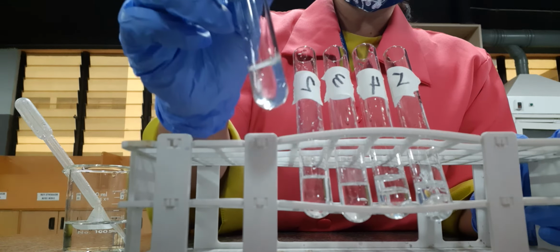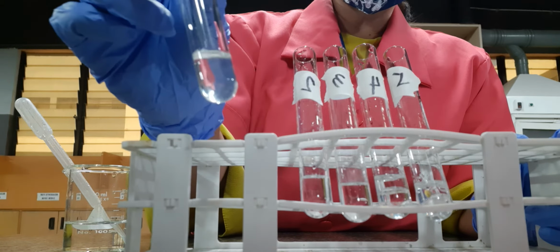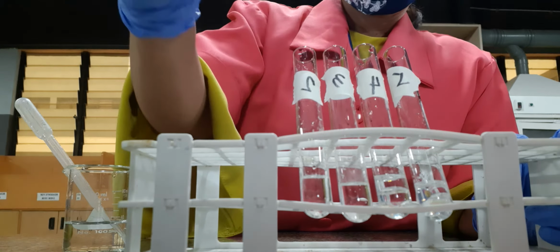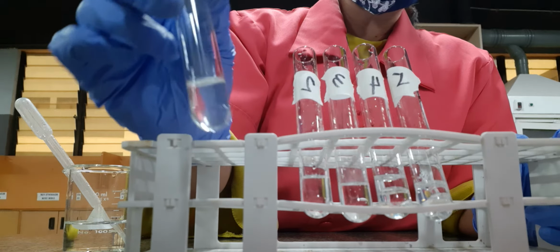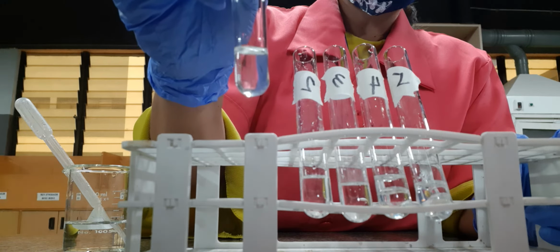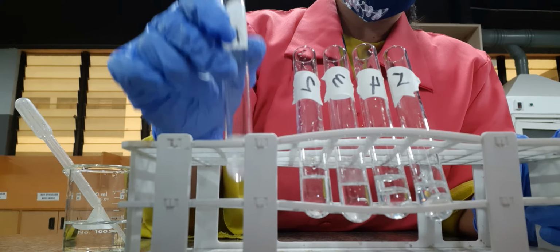So this is the result of our formaldehyde and water. If you notice, everything dissolved, so they are miscible in water. Formaldehyde and water are miscible with each other.